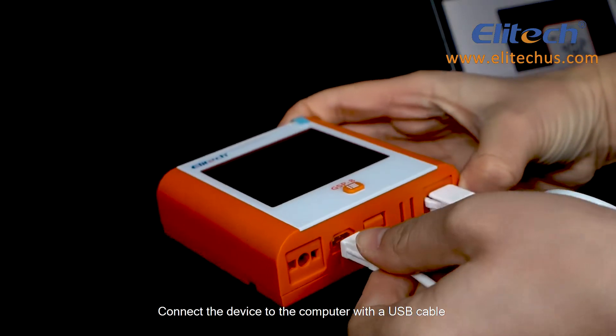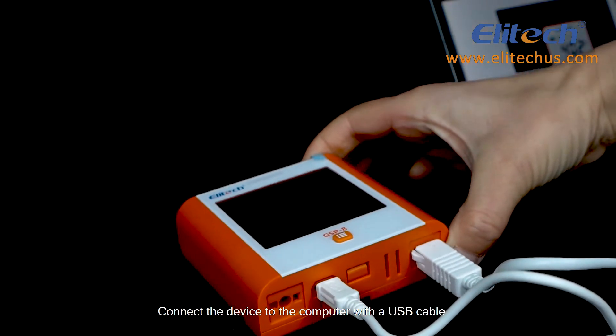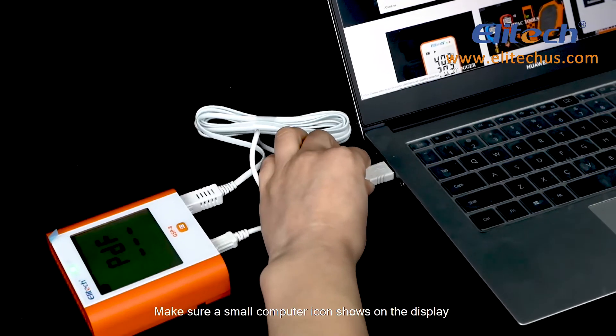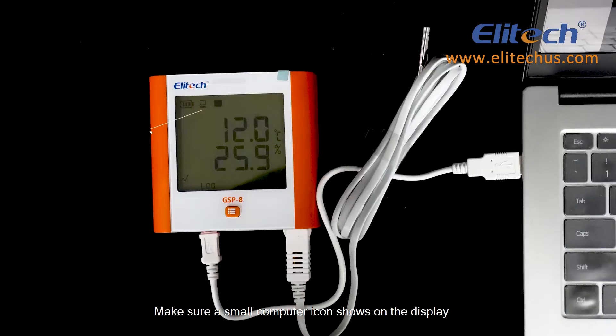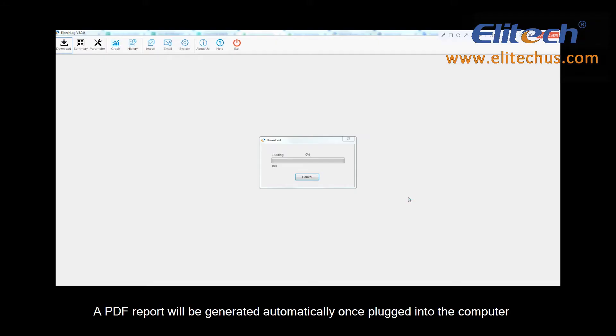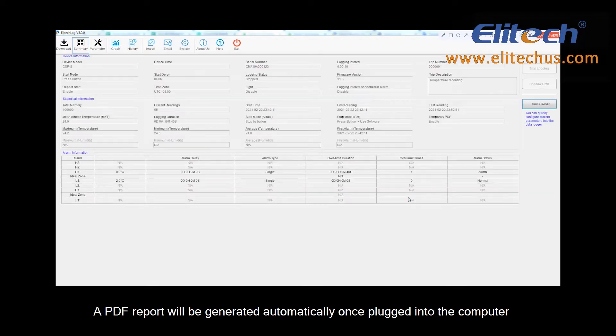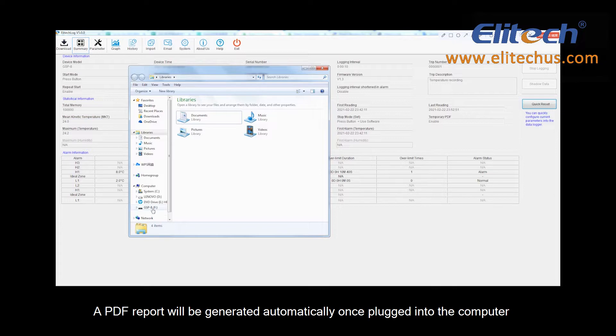Connect the device to the computer with a USB cable. Make sure a small computer icon shows on the display. A PDF report will be generated automatically once plugged into the computer.